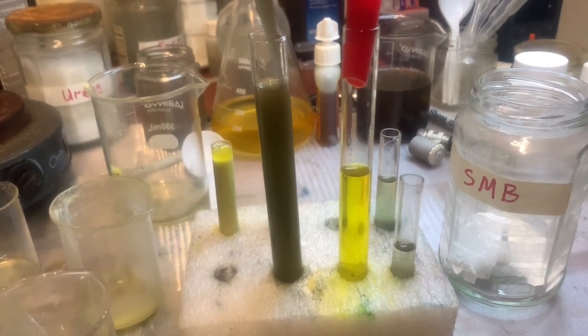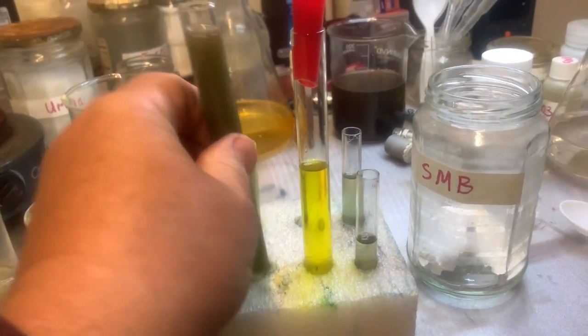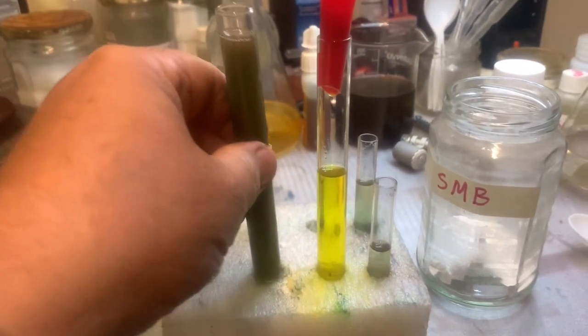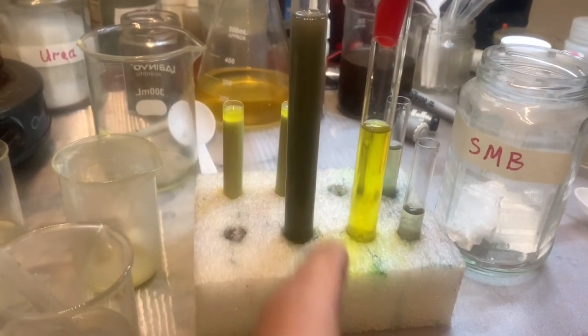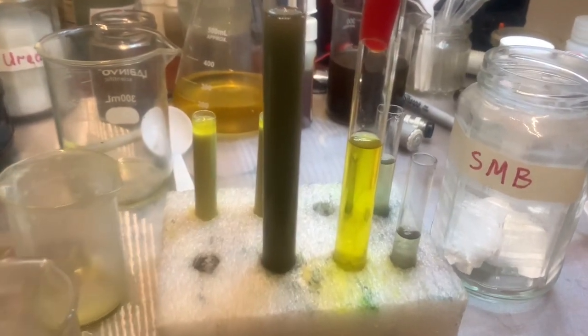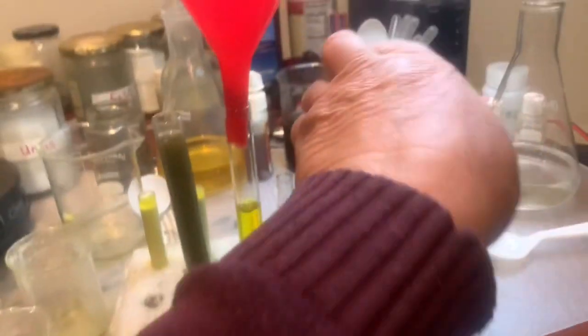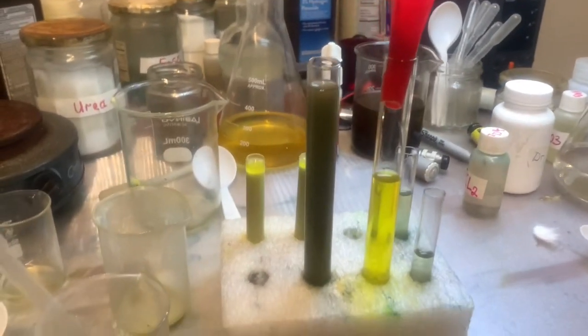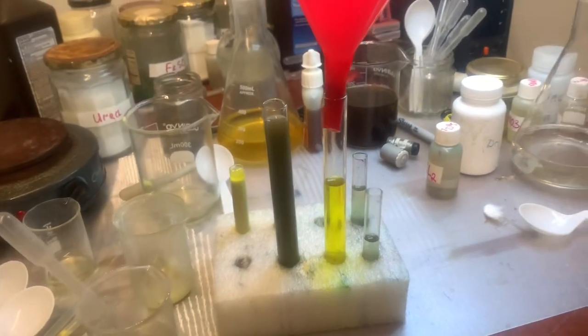That way we're working. I wish I could mix it. Oh, okay. So now it's just a waiting game. Wait till everything falls down, so another 2 hours, 3 hours, who knows? Till the solution gets clean, okay? And this one is still going.